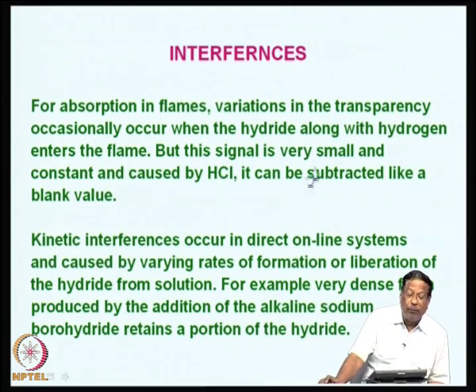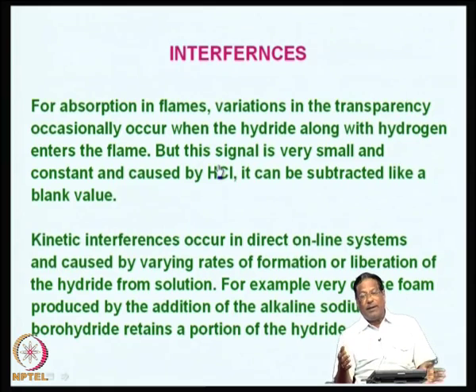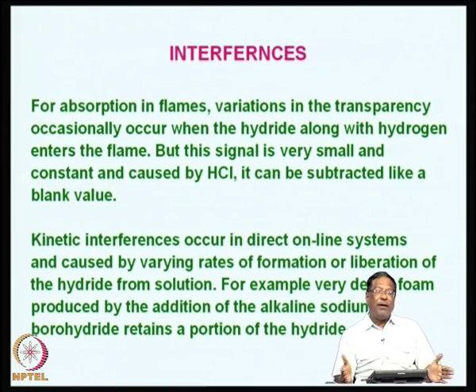So, when we say you can separate hydride from most of the matrix elements, the variations in the interference of other elements, it does not mean that the system is absolutely interference free, because there are possibilities that various kinds of transport interferences can occur.